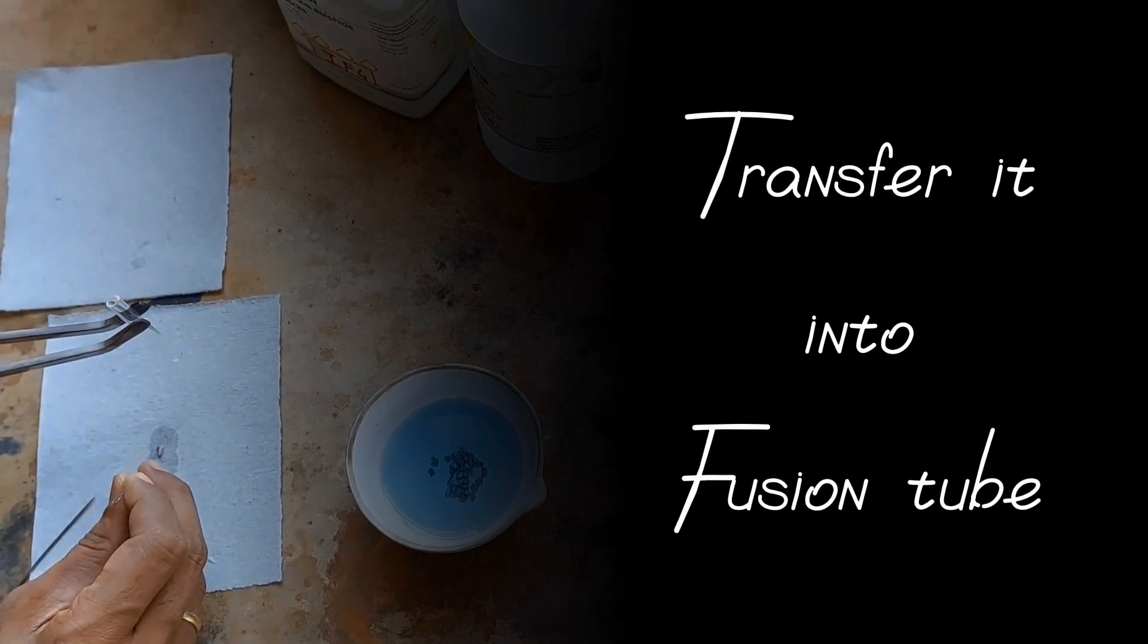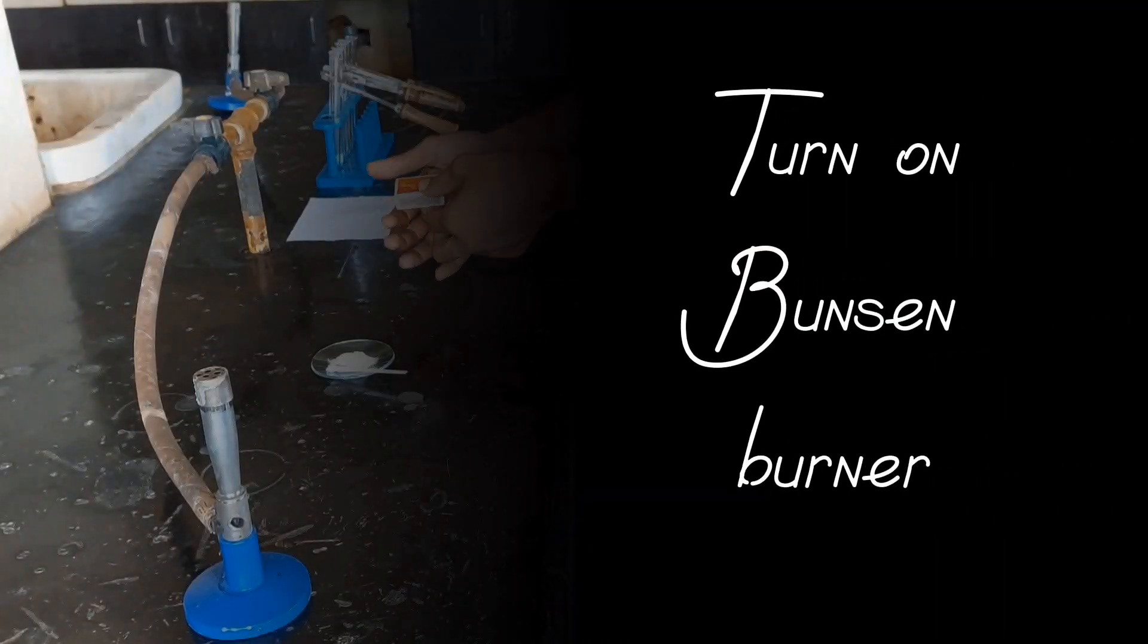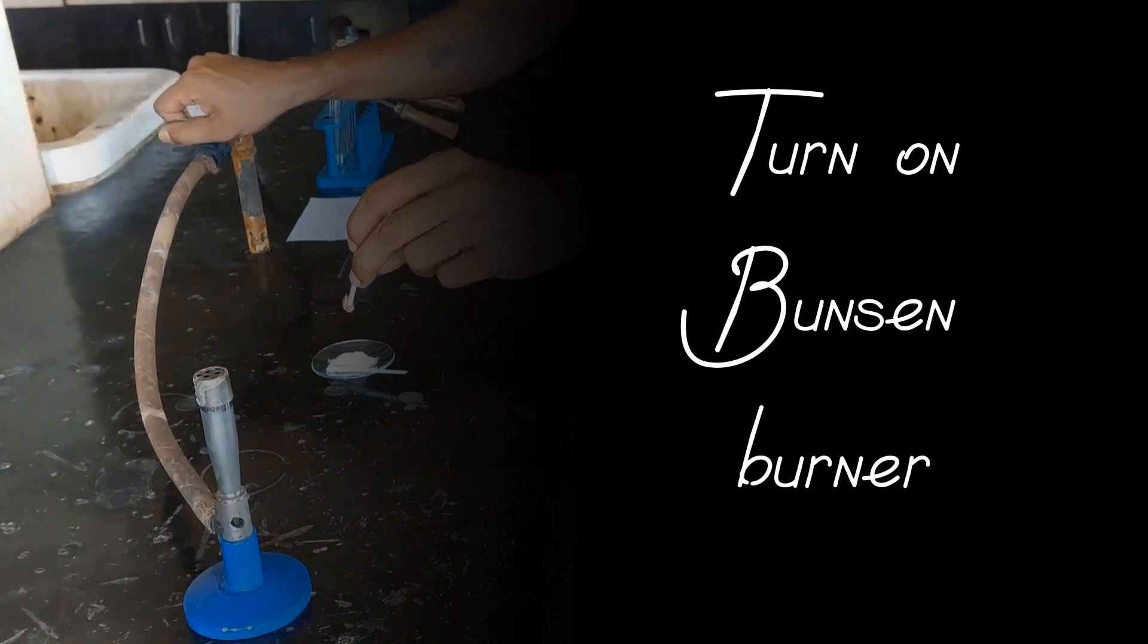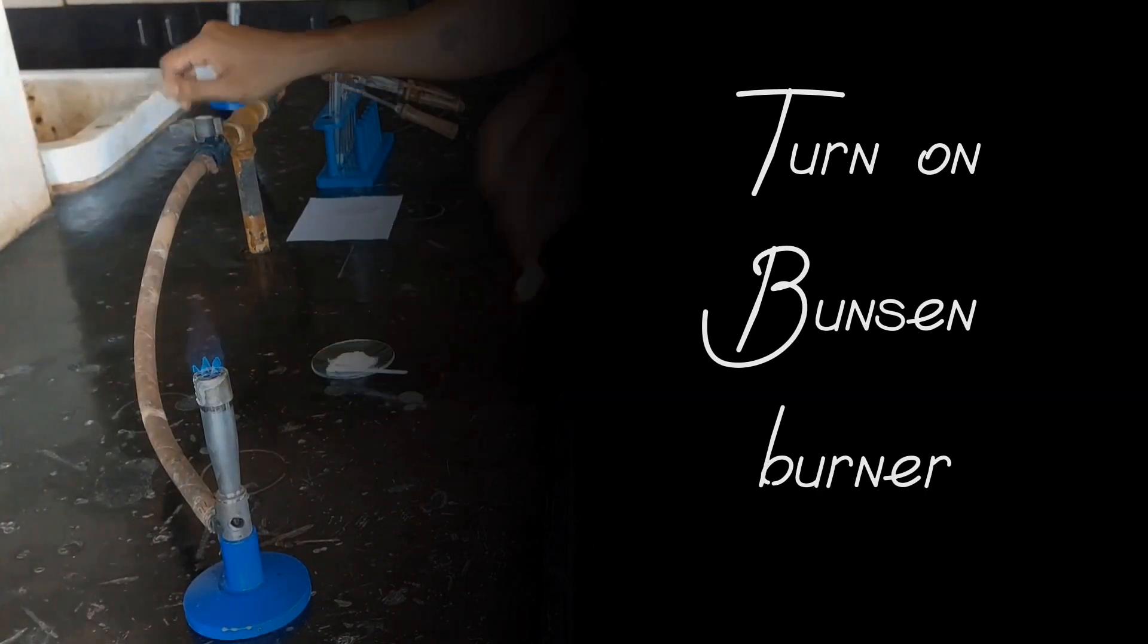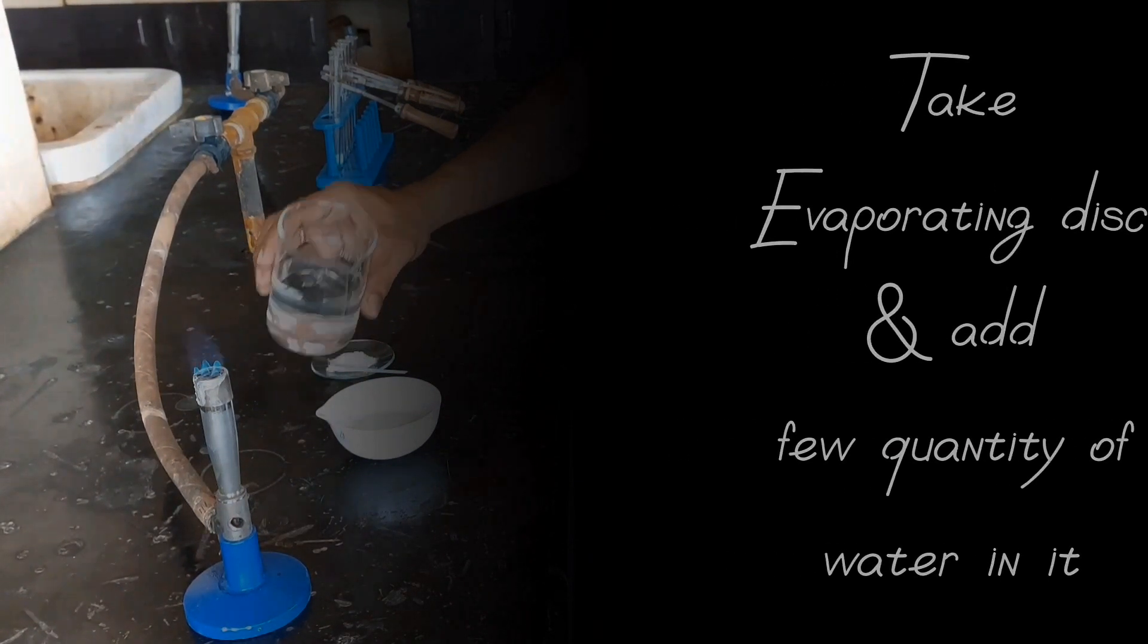Transfer it into fusion tube. Turn on Bunsen burner. Take evaporating disc and add few quantity of water in it.